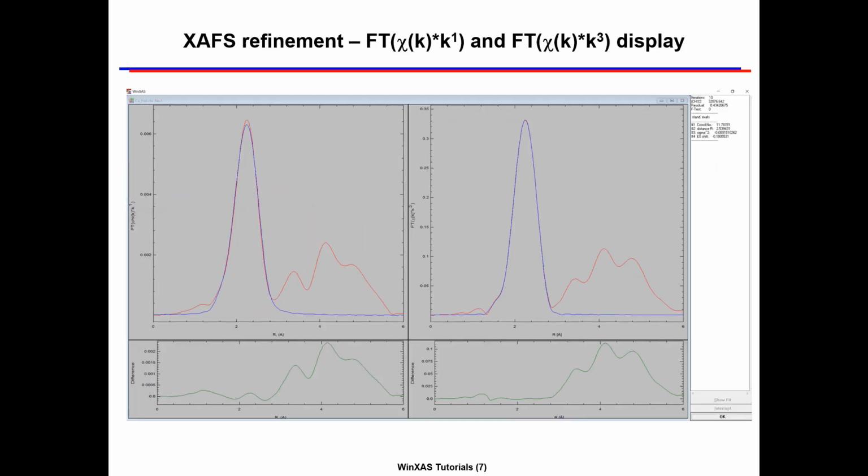On the other hand, the EXAFS refinement can be carried out to 2 pseudo-radial distribution functions using different k weightings. While of restricted use for a sample with only one type of backscatterer like copper metal, it may prove beneficial for structures with light and heavy backscattering atoms like transition metal oxides.